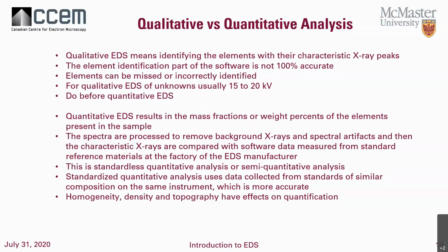And those are used to determine what the quantitative results are. This is referred to as standardless quantitative analysis. Some people also refer to it as semi-quantitative analysis.